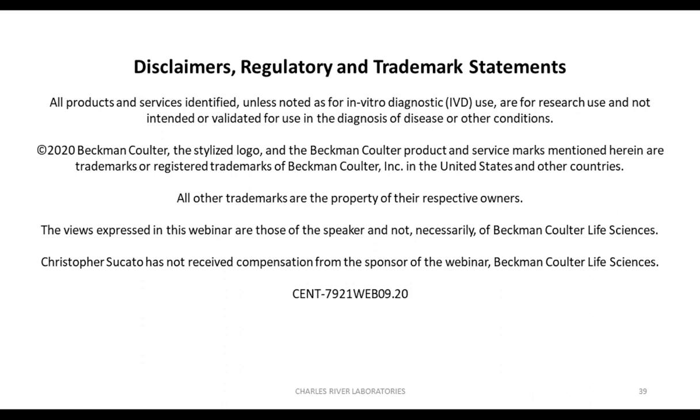Thank you, Dr. Sucato. So the second question is very much in the same context. Does Charles River Laboratory also perform any orthogonal or complementary assays for gene therapy products such as AAV?